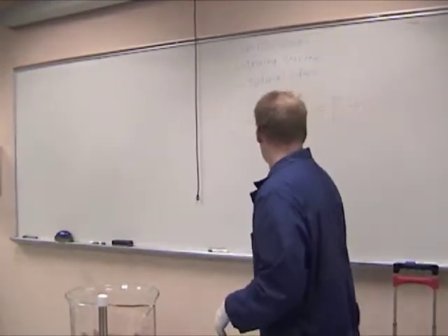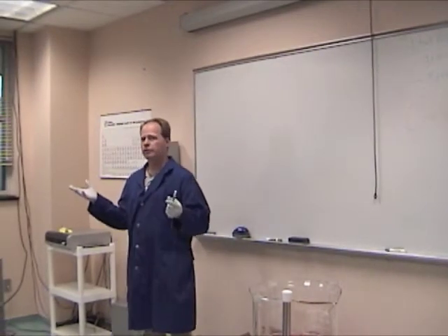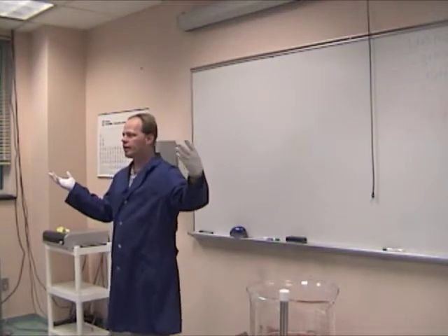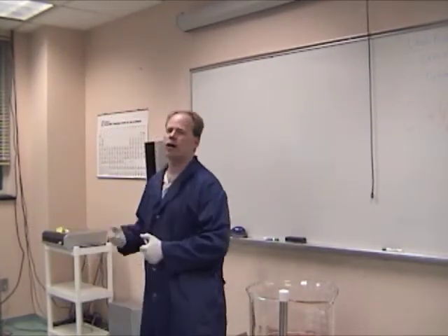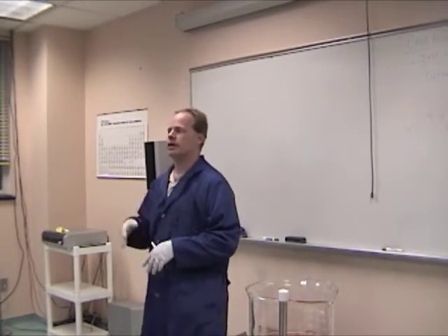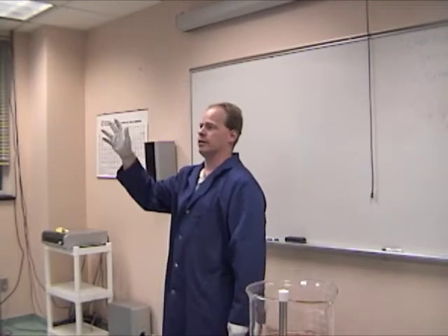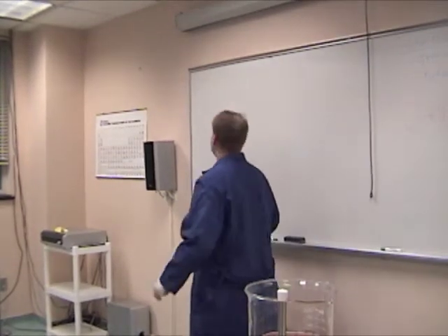Okay? So let's talk about titrations. How many of you made a volcano in high school or elementary out of baking soda and lemon juice? That's all we're doing with titrations. You read about how hard it is to do on the internet, and it confuses you. Have any of you ever been confused by watching titrations? I know I was when I first started. My goal is to hopefully make it dumb enough and easy enough for you to understand.